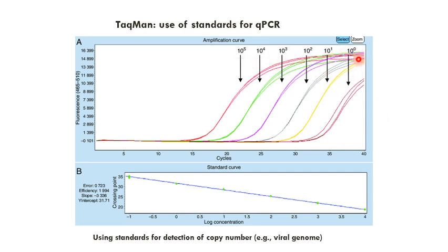If you see here, it says to the power 0, to the power 1, and once you go here, it is to the power 5. It means here it has more DNA. And if you see the standard curve, it will go this way because it will start high, then go low until it reaches the baseline.